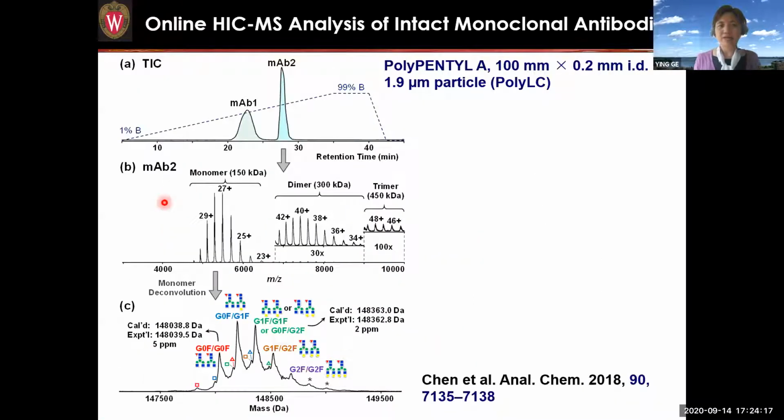So then we find that this has a really great usage for monoclonal antibody separation. I don't know how many people here are from the pharmaceutical industry. I see some of you work at Janssen, Johnson & Johnson. So maybe for the antibody drug conjugates, which are really rising as a very important biologic for therapeutics.